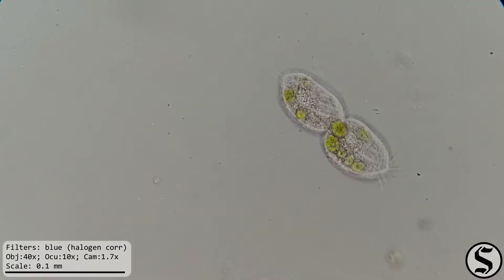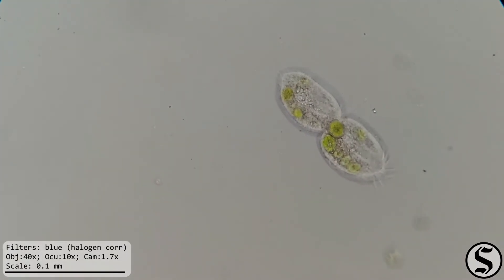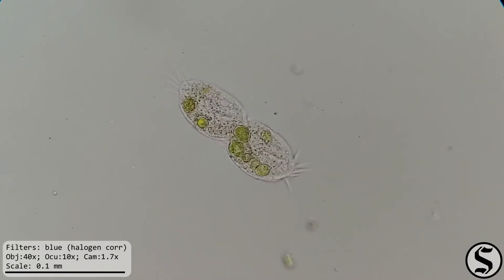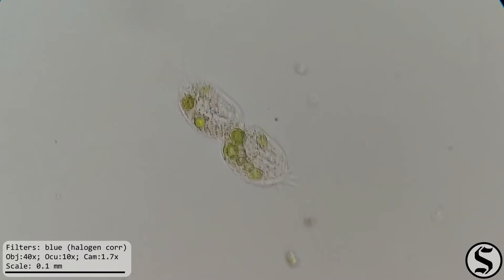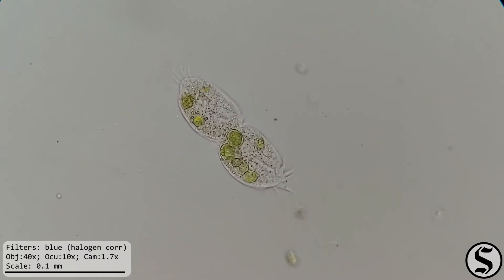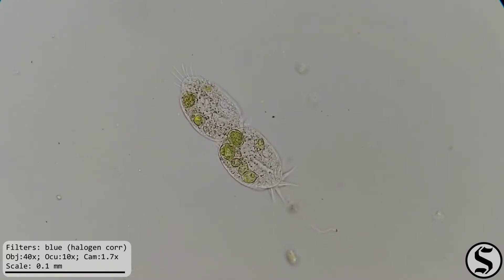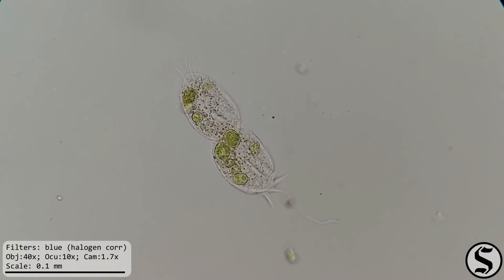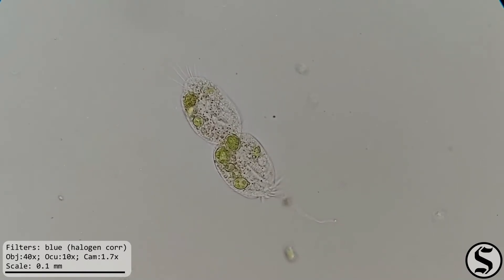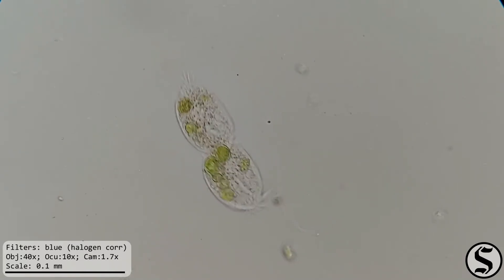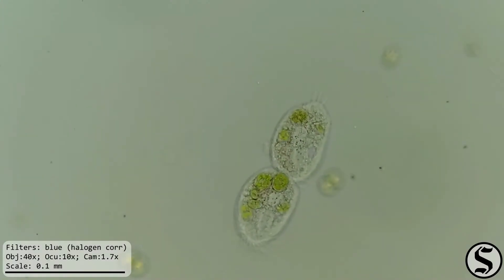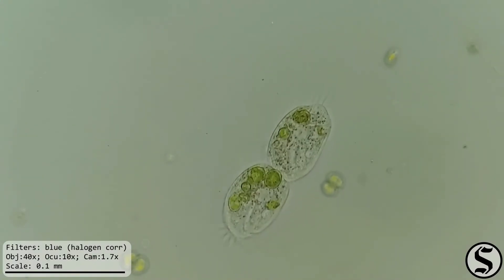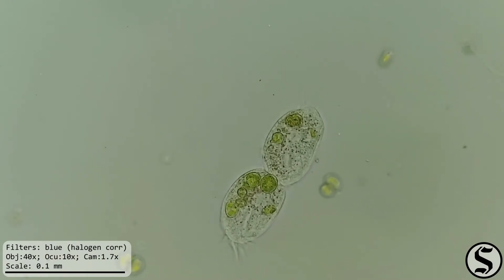And we can see at high magnification that it is in the process of dividing. You can see that it's really pinching together in the middle and that there are still things that are shared between the two cells. Looks like it was really munching on that green algae. That's probably why it's ready to divide, being well fed, favorable conditions. It's much warmer in my house than it is outside.